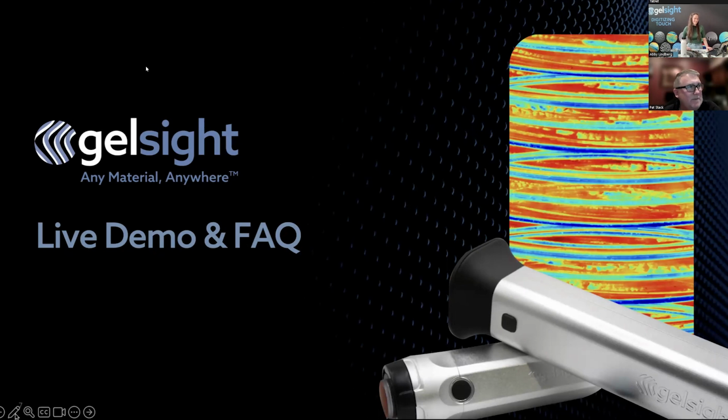Next question. This technology seems to be optimized for flat surfaces and surface roughness measurements. Is it suitable for damaged surfaces, characterization, and topography measurements for in-service components with complex geometries such as turbine blades? The interest in this case is to get all the dimensional and shape information of the damage that can be used for further risk analysis.